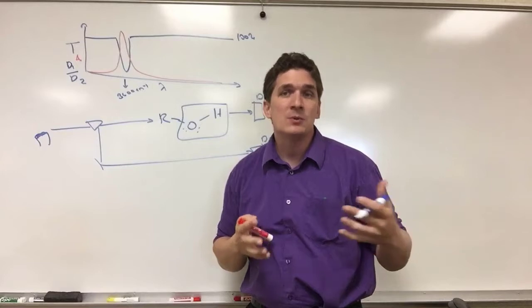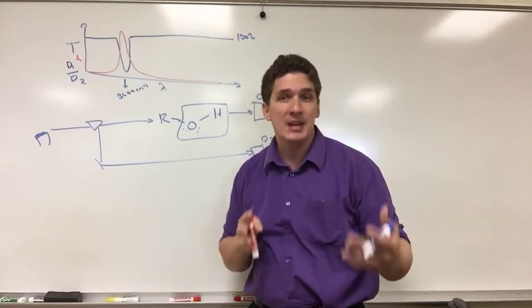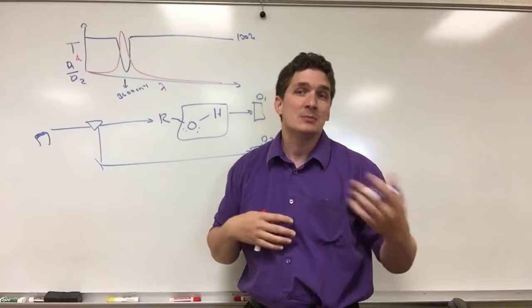And we can go to tables, look up what functional groups we expect to be there, and based on the shapes, we can also resolve between ones that may have similar vibrational modes.